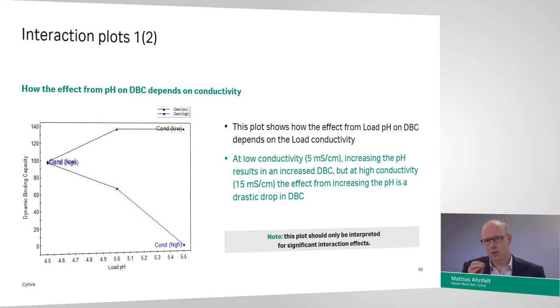We should also take one moment here to mention the resin that we're actually studying. It's the Capto S resin, as we said. That's a cation exchange resin that has been grafted to get an extended surface. So there are extenders on the surface of the beads to make the capacity higher and the mass transport quicker.